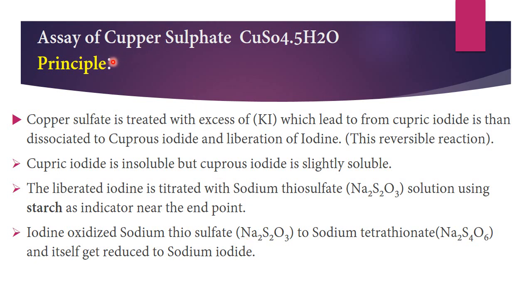قلنا إنه official principle or official titration method اللي هي iodometric titration.